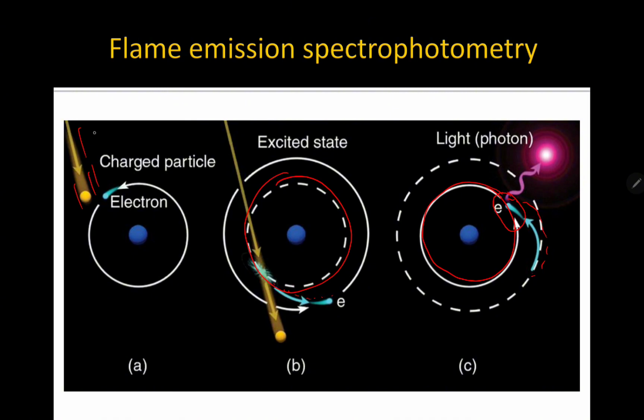So remember, after ninyo ipa-excite yung ating electron, nandito na yung valence electron natin, normal lang. Kapag na-excite na siya, mawawala siya sa kanyang orbital. And then it will cause the electron to jump or move around, away from its orbital, causing movement. And then eventually, it will stop. And then yung moment na pagbalik niya sa kanyang orbital, again, it will emit energy. Or, mas better term, it loses energy in the form of light. And that process is what we call emission.